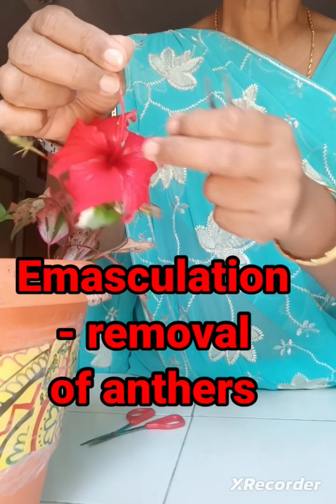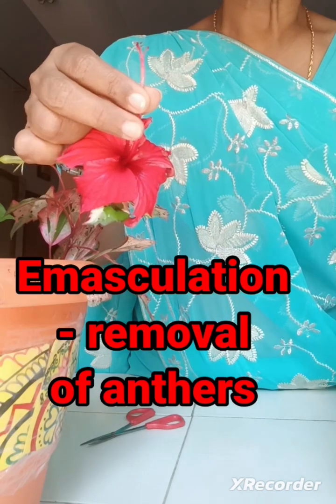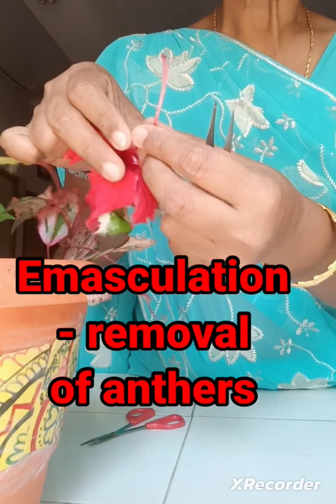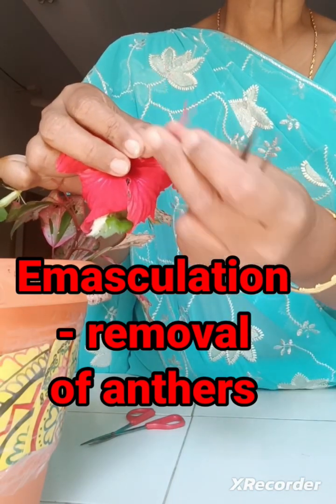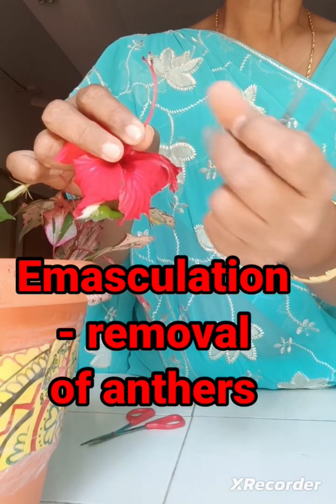Because the flower is bisexual, there is a chance of self-pollination, so that's why the anthers are removed before maturation. After removing all the anthers, you can now see the stigma portion — the gynoecium portion — the stigma is visible here.